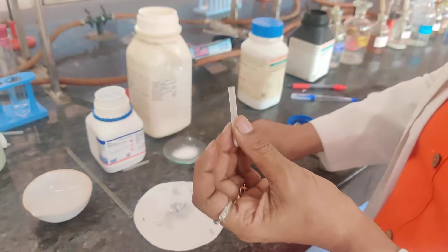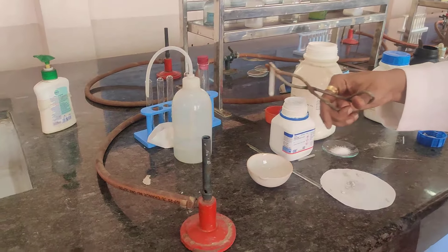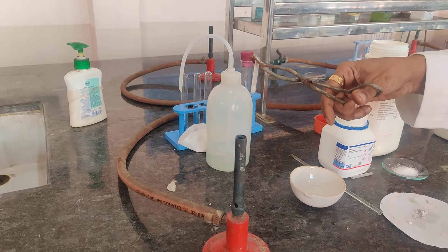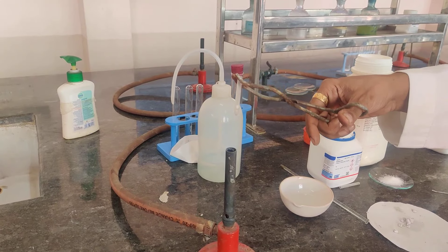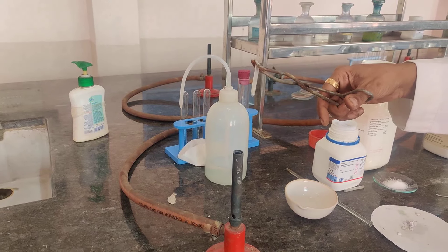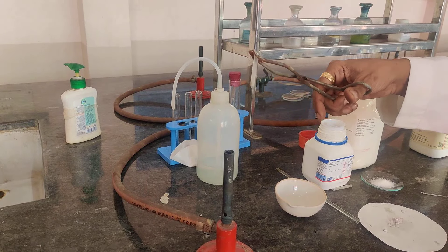Now once this is done, you need to hold it and strongly heat it. The sodium metal will turn shiny and like a ball, so don't heat it too much. There is a shiny ball formed — can you see? Once this shiny ball is ready, your sodium metal is ready to react.